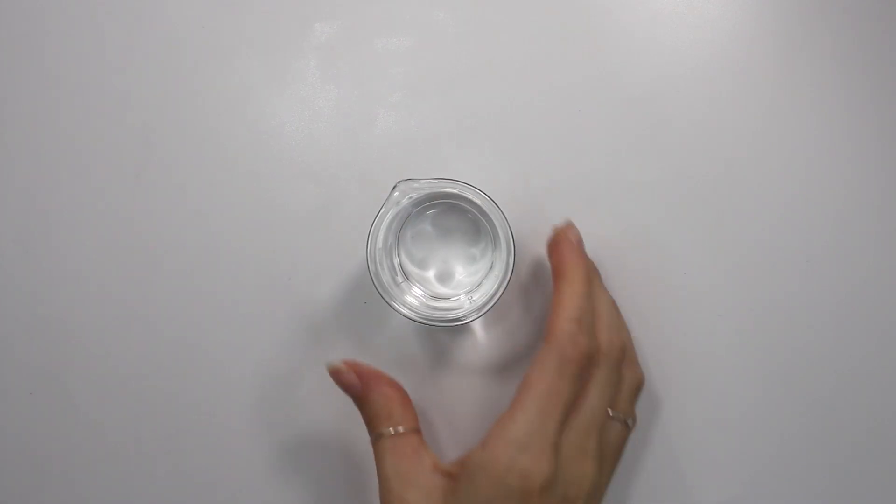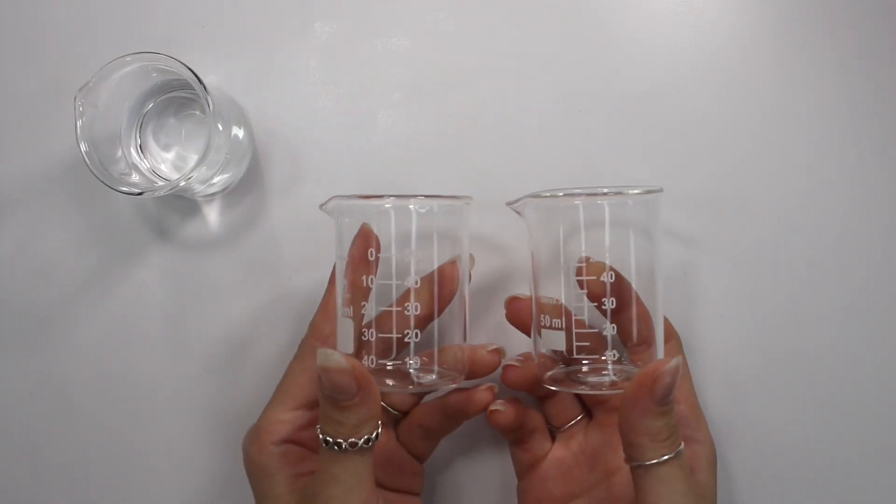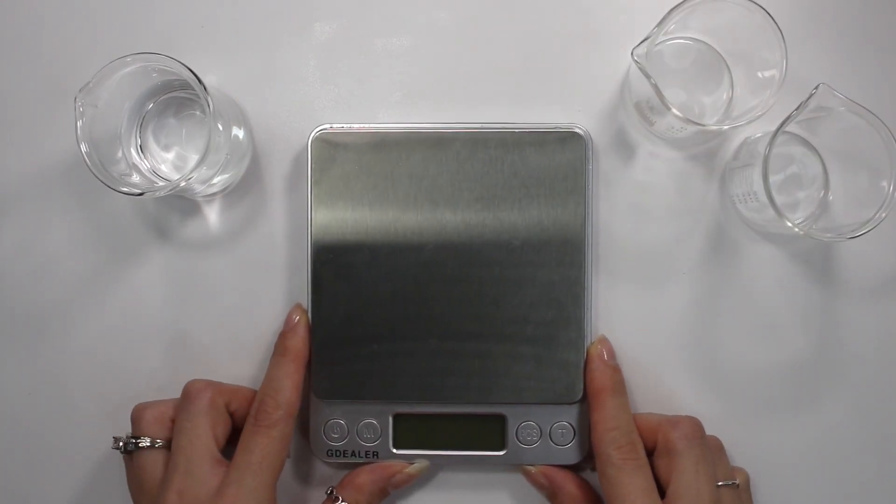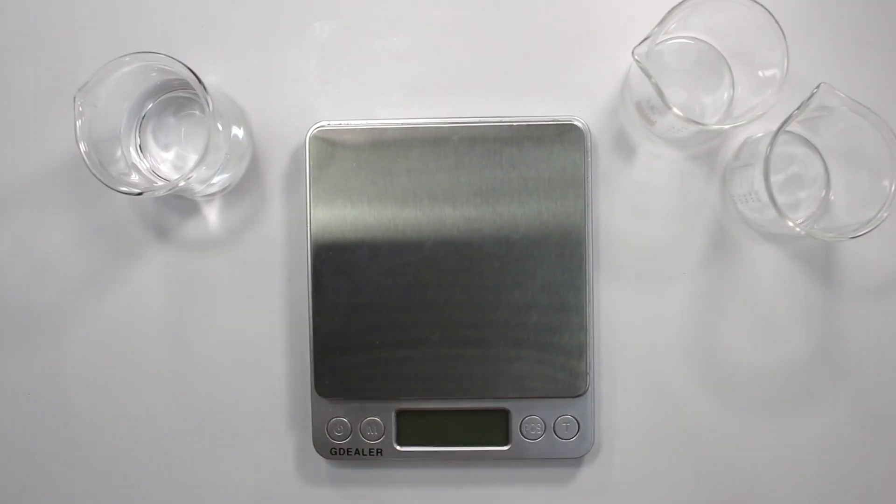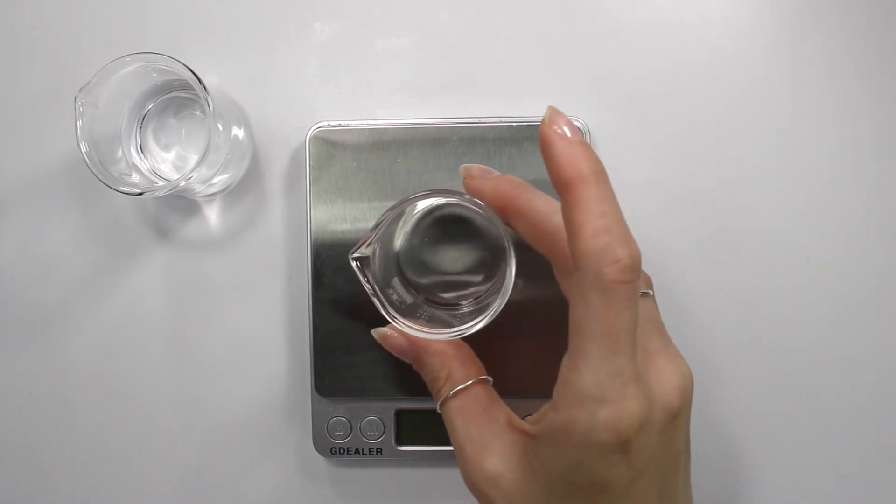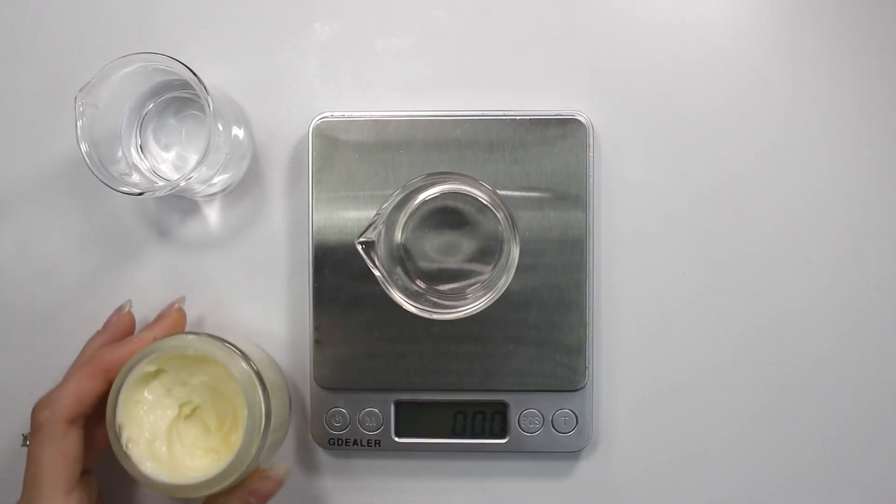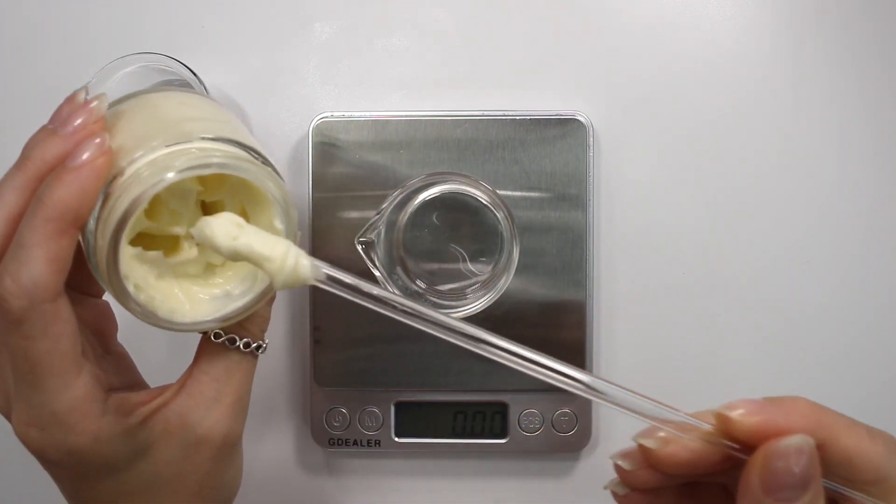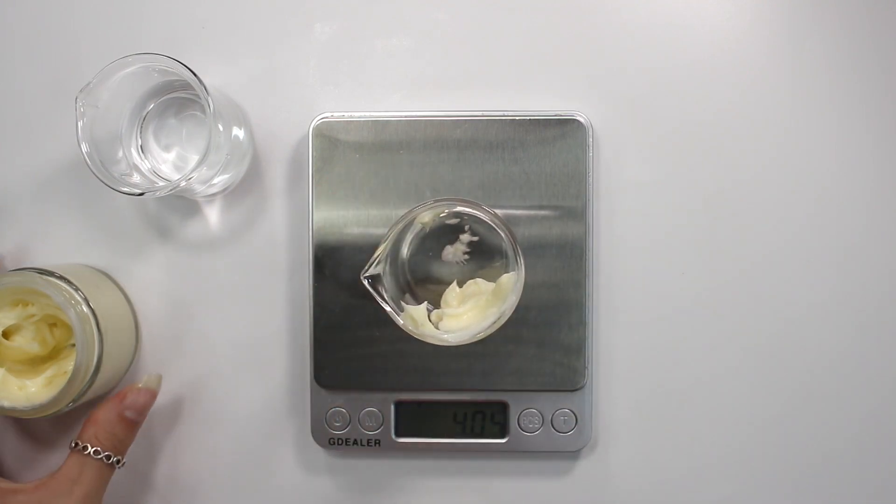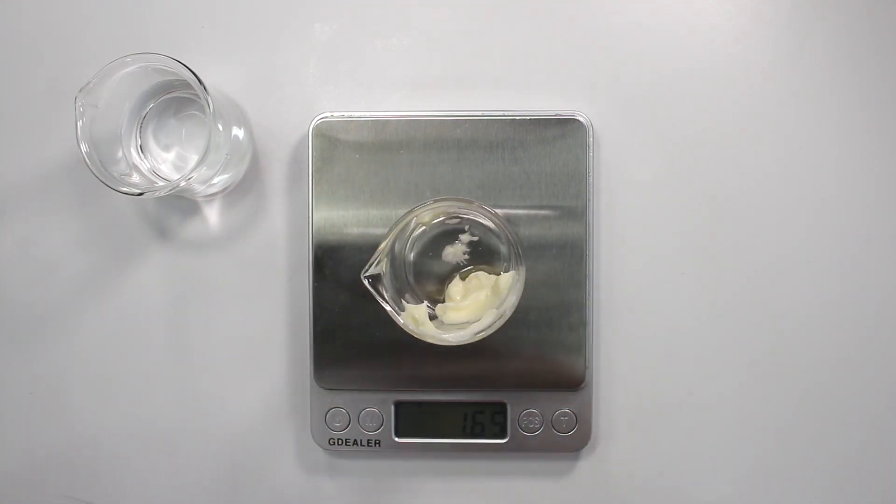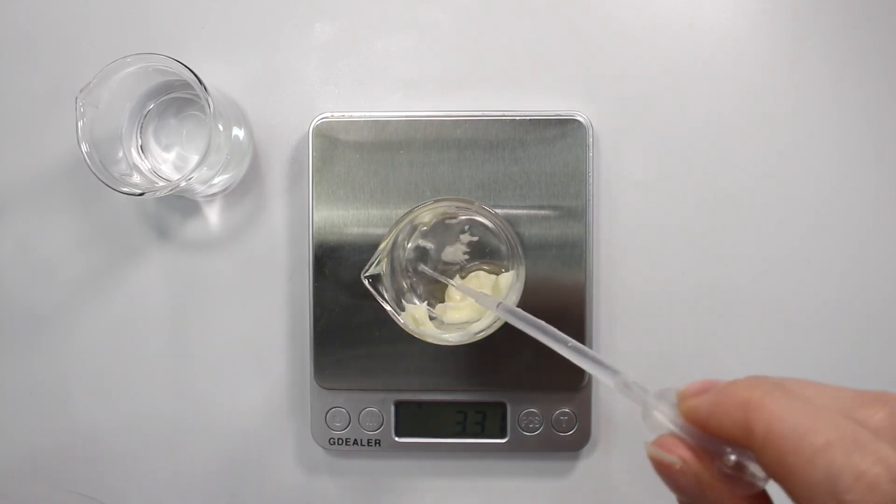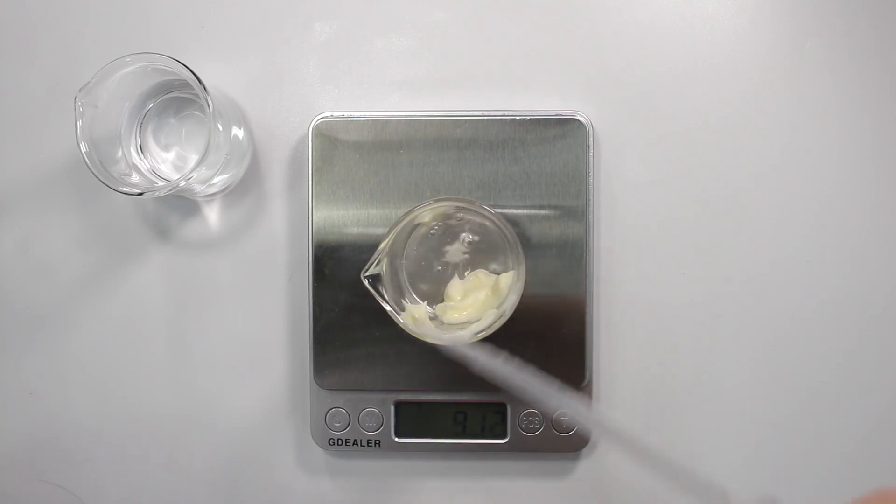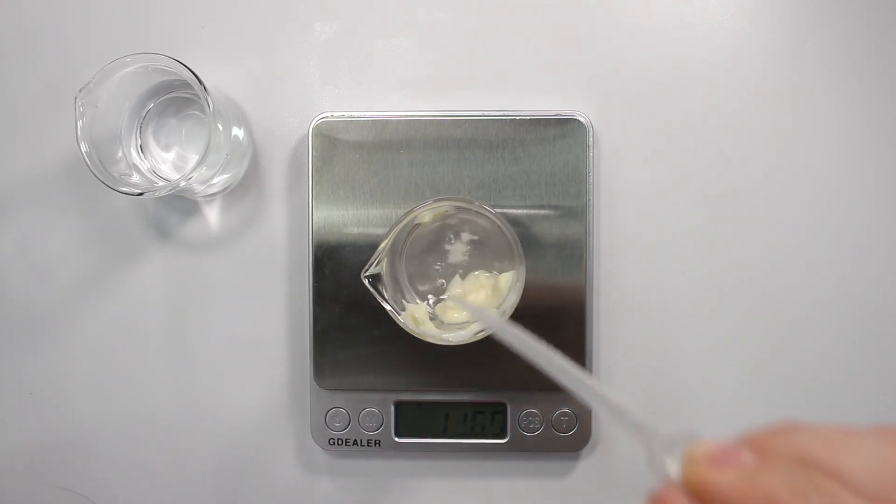So first you want to start off with just a small container, fill it with some distilled water. It can be your rinsing solution for your pH meters. And then I'm just going to be using a digital scale to weigh out 10% of my cream. First, I'm going to be showing you guys how to take the pH of a cream.